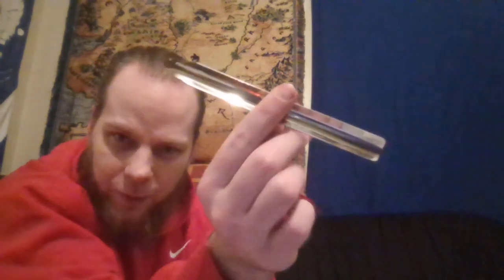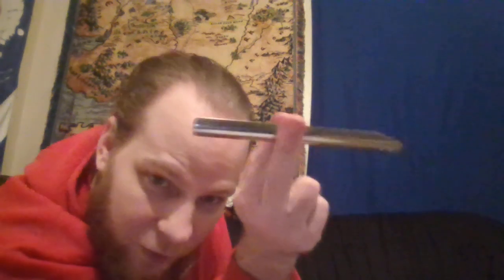You'll have a paper towel, a spatula, and I trust everybody remembers that the pointy end is the end that comes in contact with the chemicals, not the round end. This is the end you touch. This is the end you don't. And this end should always be sitting on top of a paper towel so that someone can tell that this is the end that's actually been used. So don't forget that. The other thing we will have is tweezers, which you'll be using to keep a grip on the unknown because they're going to be very small pieces. These will help.